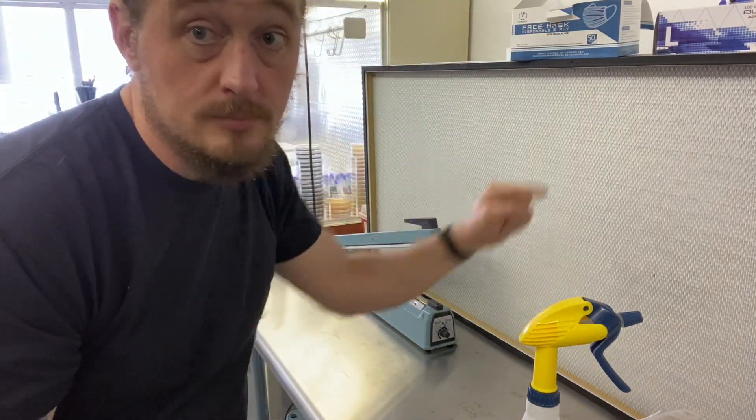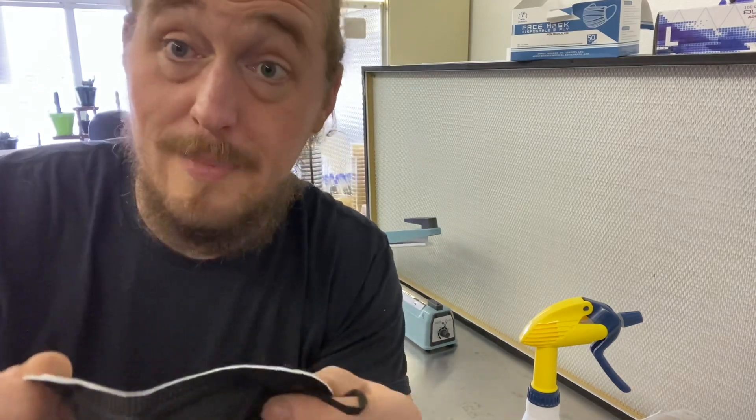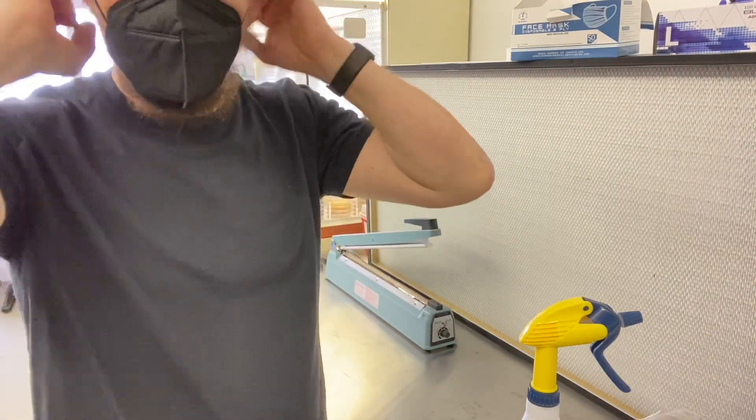Admittedly, the spit should go like this — water is heavier than air. So, I'm going to mask up. So, I've washed my hands, I've washed my face, I've put on a mask.